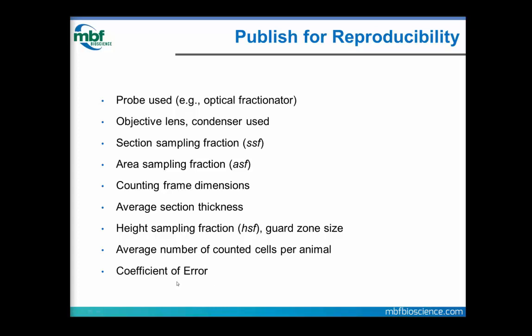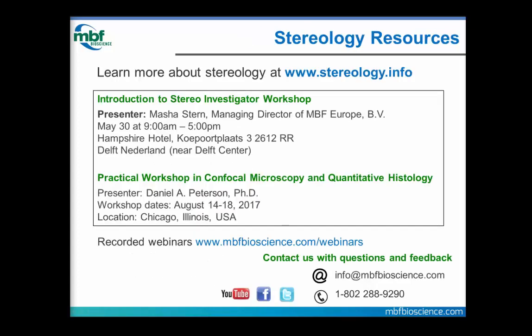I want to thank everyone for your attention today. Please go to stereology.info to learn more about the optical fractionator probe, or if you can't get thick sections, you can learn about how you can use contiguous thin sections to do the physical fractionator probe. We can learn about probes for length, for surface, for volume, for second order.